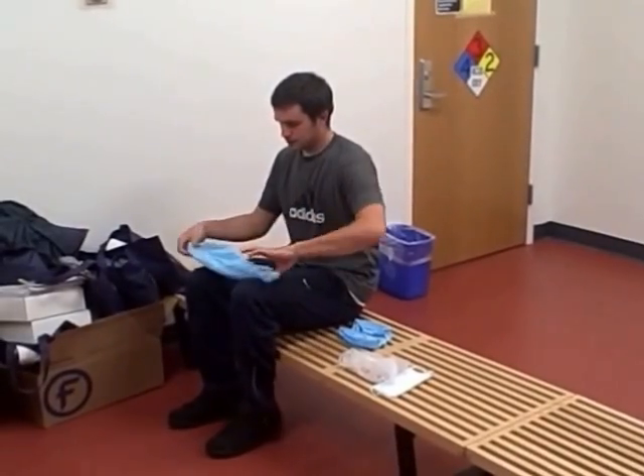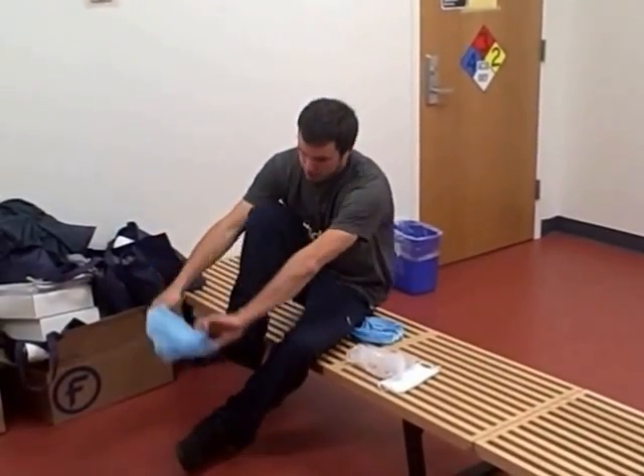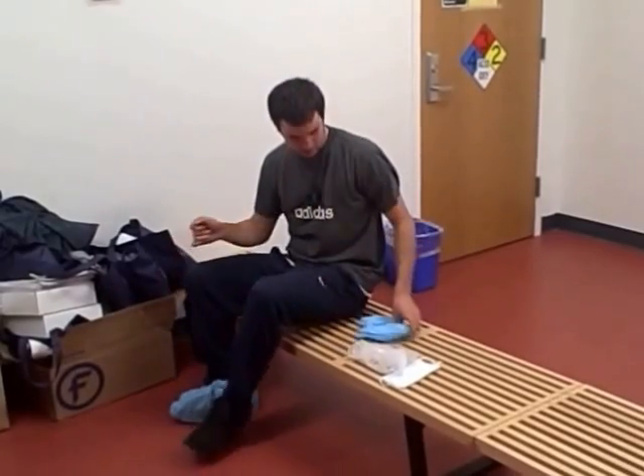First, put on your shoe covers. Next, put on your hairnet. After putting on the hairnet, put on the face mask.